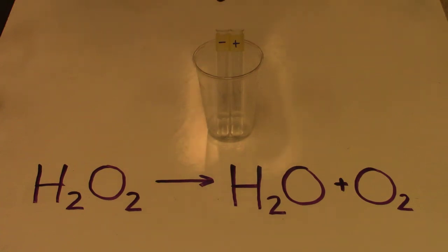Welcome, biologists. I'm Mr. Forbrook, and today we're going to be taking a look at Investigation 13.1. This is the qualitative analysis of enzyme activity. The purpose of today's investigation is to collect evidence to support objective ENE 1E, and that's to explain how enzymes affect the rate of biological reactions.